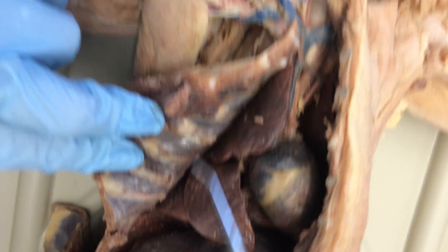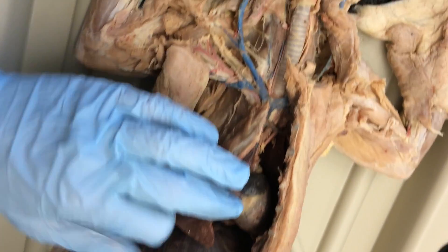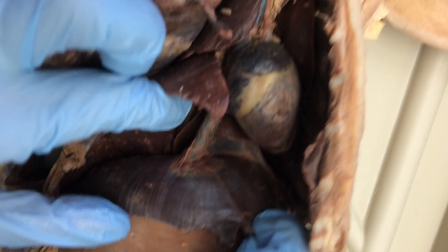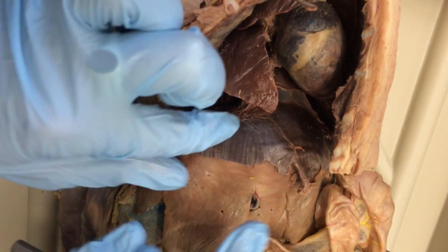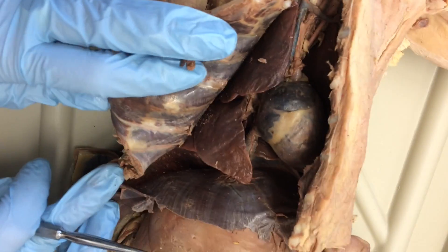The rest of them are pretty straightforward: anterior, middle, and posterior. And then the diaphragm — that's easy, you know what that does. I think that's all the respiratory stuff.